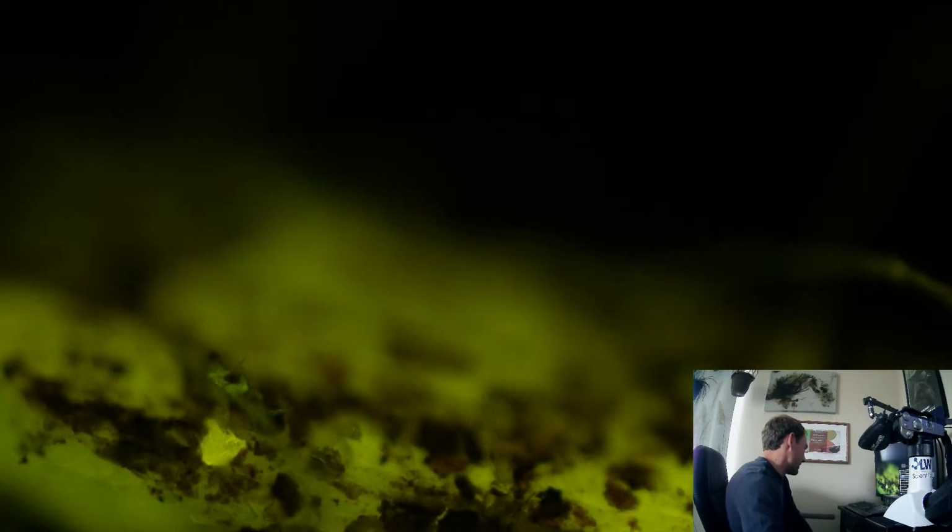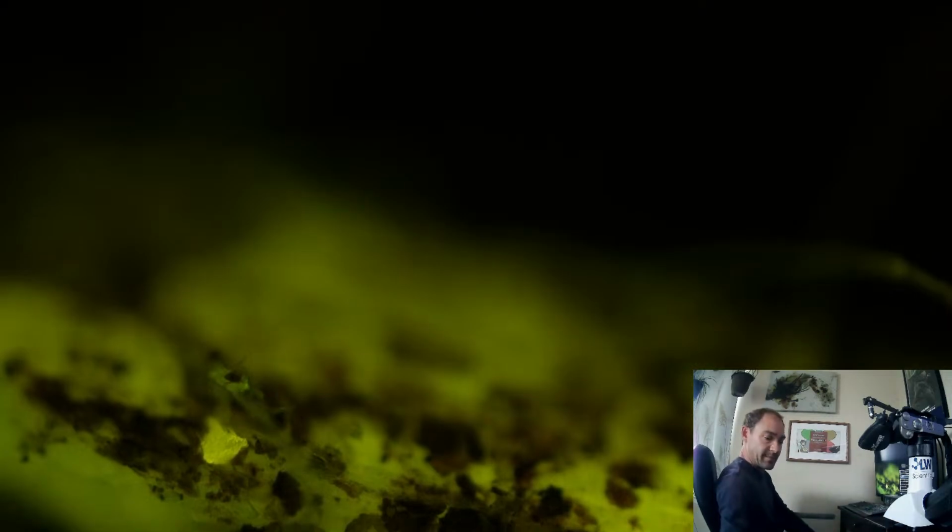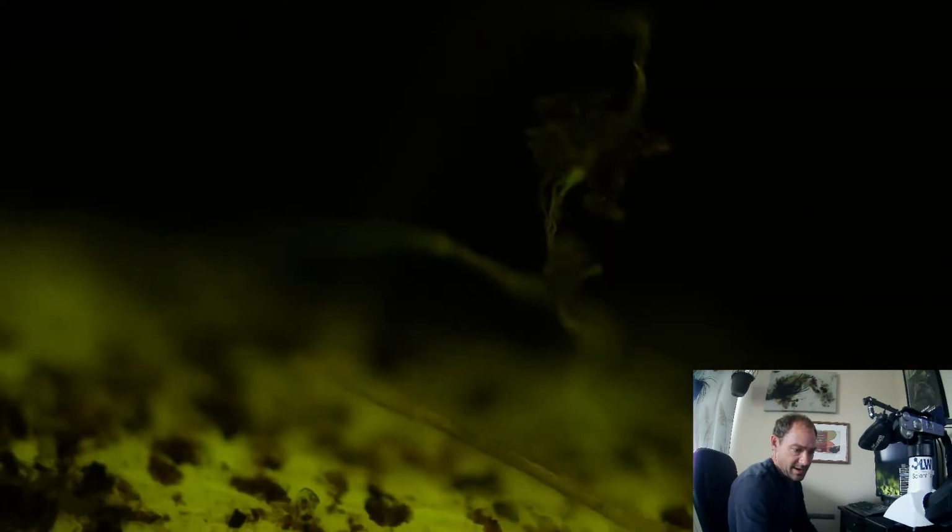Yeah, right there, it looks like fungi and might even be an inoculation site. So we see a little strand, little aggregate, and then pretty bright green under it. I like seeing the neon green, not so much the yellow. But anyway, we're going to go on next to, what's the next root?